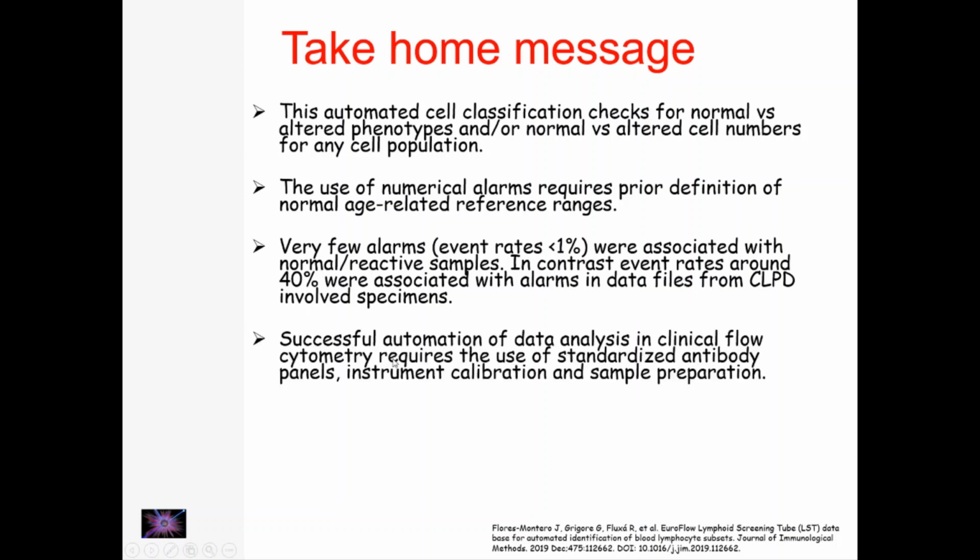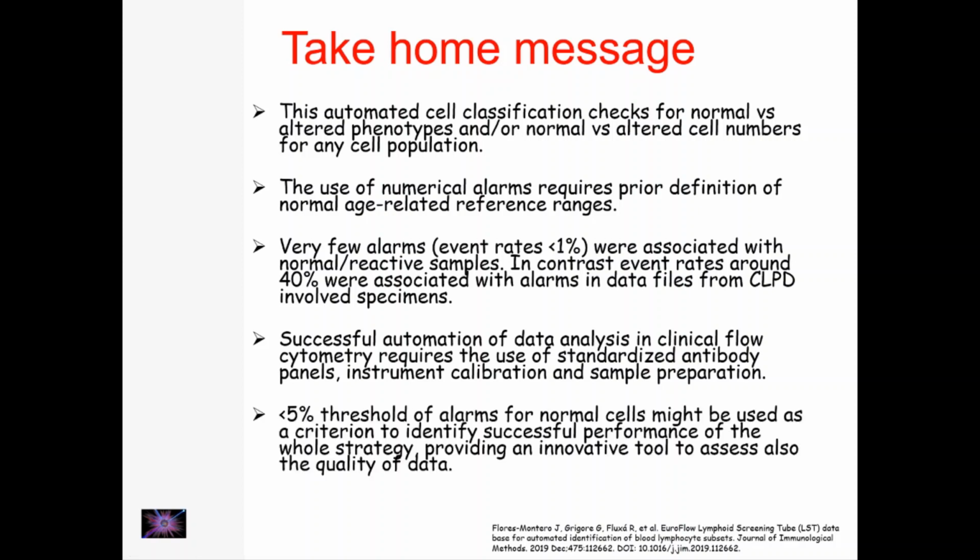Very important to remind you that successful automation of data analysis in clinical flow cytometry requires the use of standardized antibody panels, instrument calibration, and sample preparation. And this is a key feature, because otherwise you cannot compare your sample against the reference EuroFlow LST database.